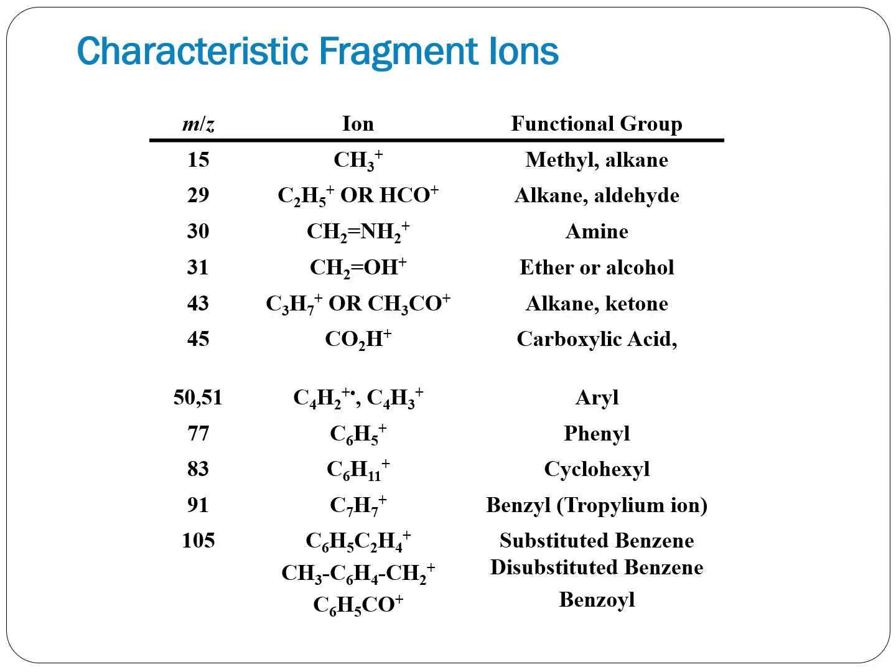So for example, in most cases when we see a mass-to-charge ratio of 15, it is because a CH3 has been lost from the molecule. That would usually indicate that you have an alkane and there's some kind of methyl group that has been lost. We saw that the carboxylic acid will give you a mass-to-charge ratio of 45 owing to the COOH group. We see also that C2H5 will tend to fragment and form a mass-to-charge ratio of 29, and so forth.